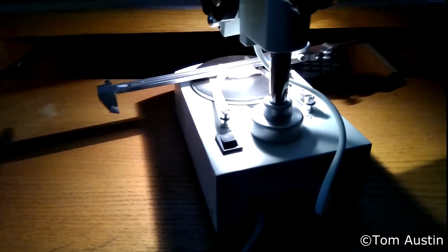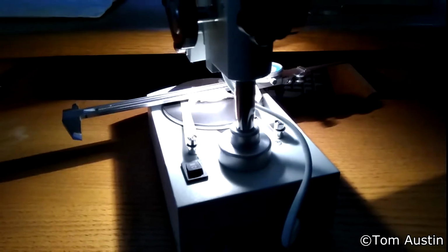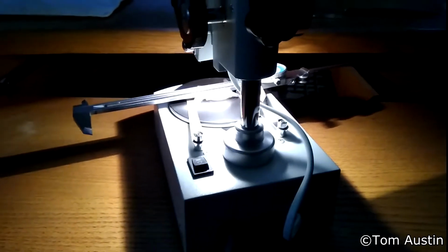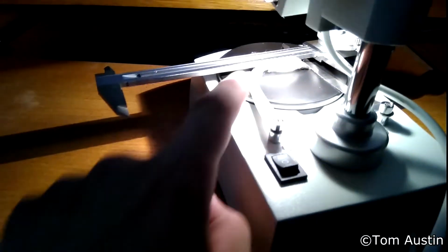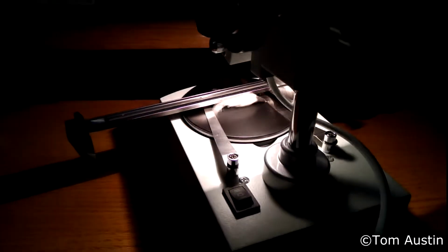I've so far picked 4 bolls, 2 of which I've left the lint in the boll for demonstration purposes. And 2 of them I went through and pulled all the seeds out and inspected the lint itself. And a lot of them were like that one up there, just very weak lint, just sort of rips apart as you pull it. And then I got a couple of good mature ones, like this one I have here underneath the dissecting scope, which have very strong, nice fibers.